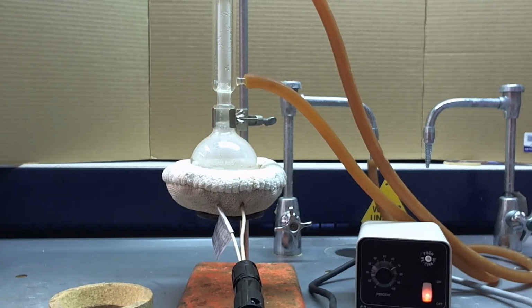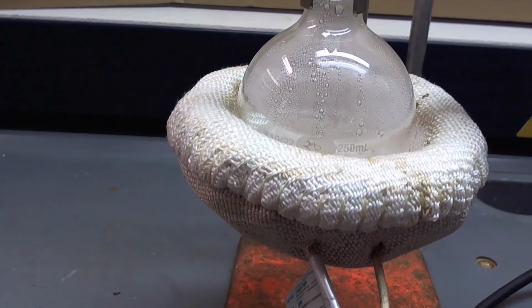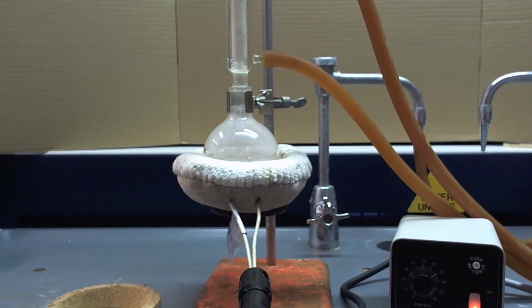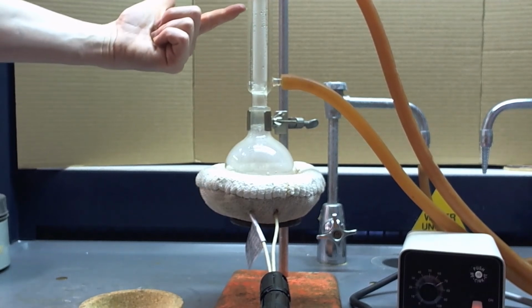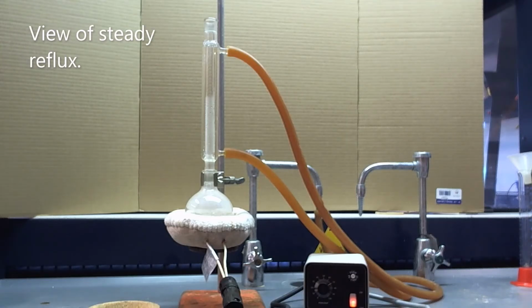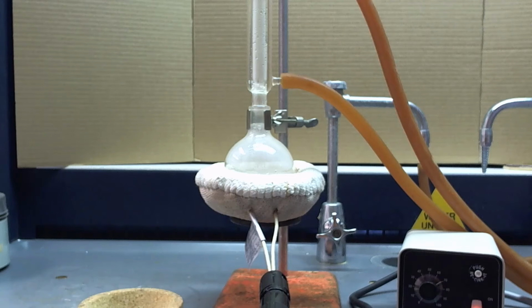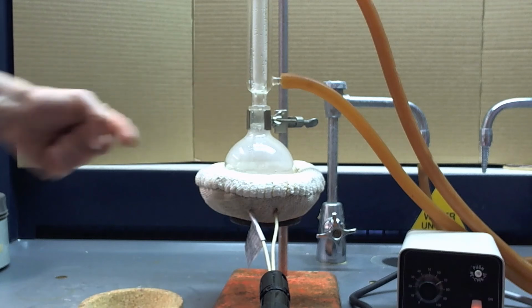So now that we've been heating the flask for a little while, if you look inside, you can see that there's boiling. Alright, so the vapor is going up into the reflux condenser, and this part is cold from the cold water that's running through the reflux condenser. Right, so it's cold. So that's where we're seeing the vapor is hitting those cold sides, condensing, and dripping back down. So if you're trying to heat your reaction under reflux for a certain amount of time, you time it not from the start of boiling, but from the time that you start to see those drips of liquid coming back down.